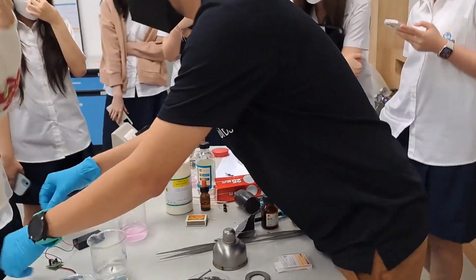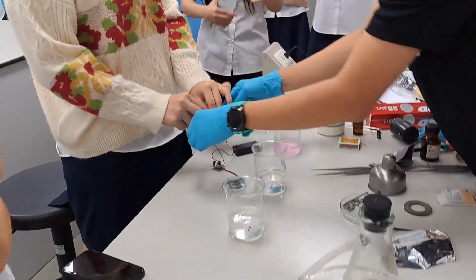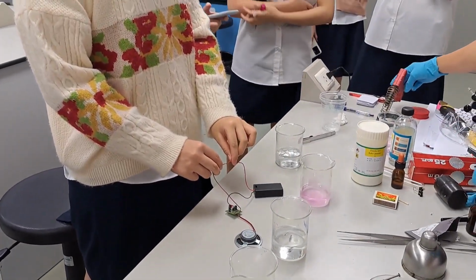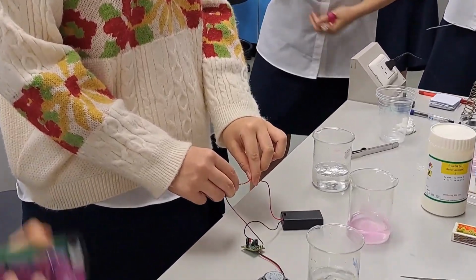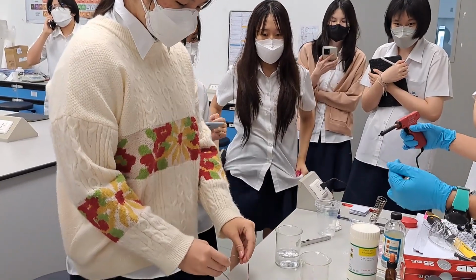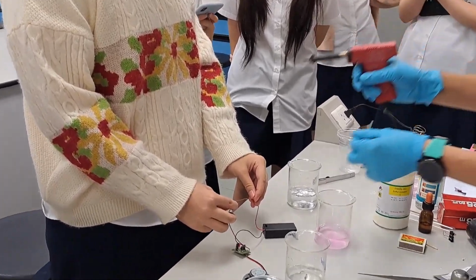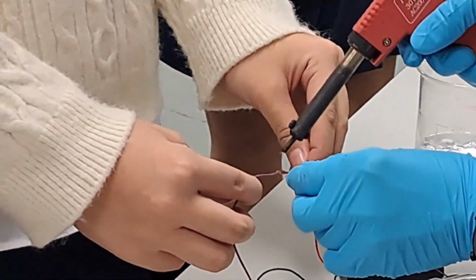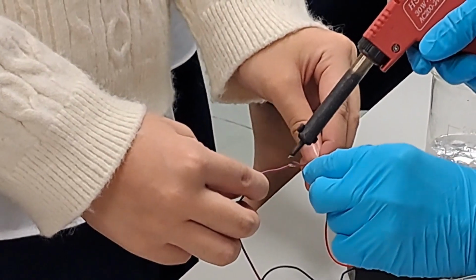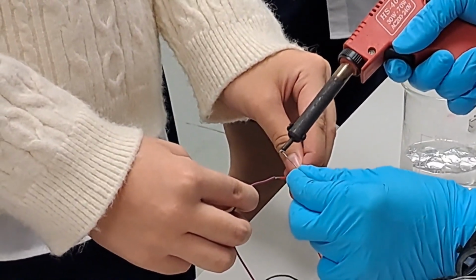Over there, I want you to hold them together like that, and I will melt the tin-lead alloy. This is called soldering lead. All right, melt it and let's freeze it back over there. No, it's just melting.